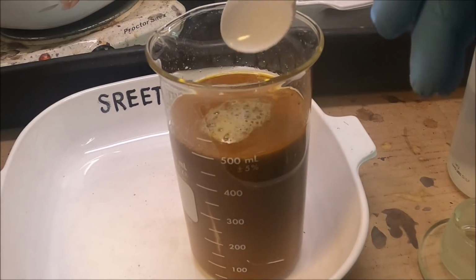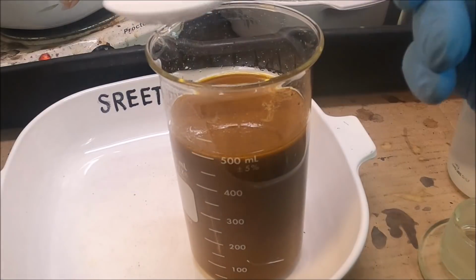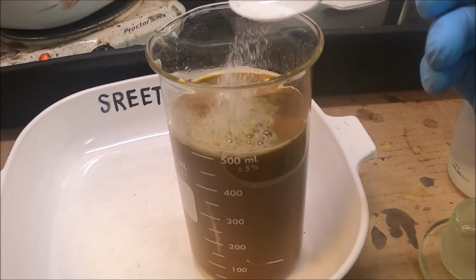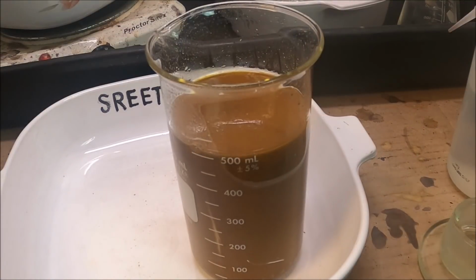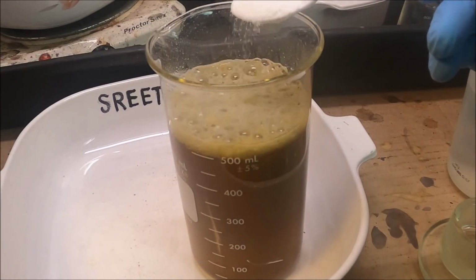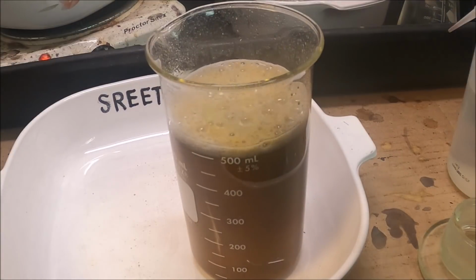And what I can do is carefully control the amount of nitric going into the reaction and add just enough nitric acid to just dissolve all the gold. So there's no need to denox this solution because there's no excess nitric in it to be removed. There's our familiar foam. We're at the end now.